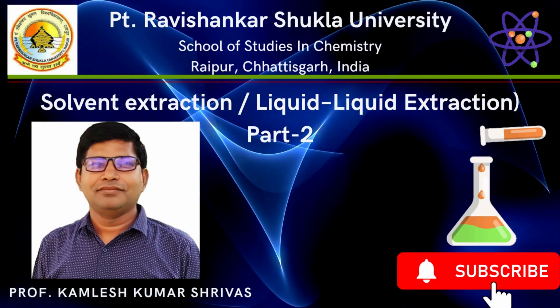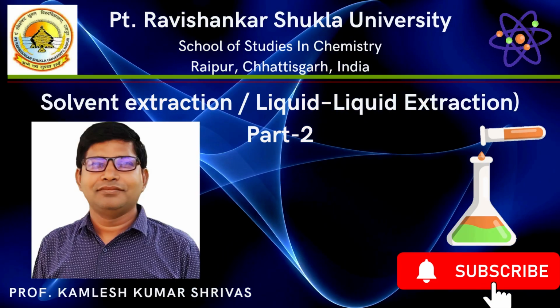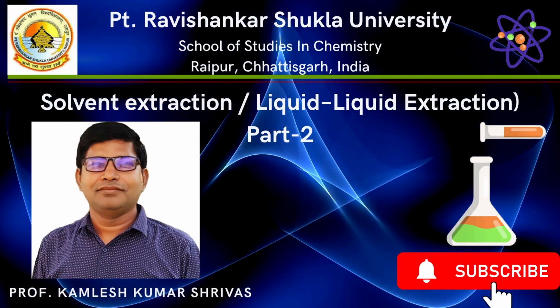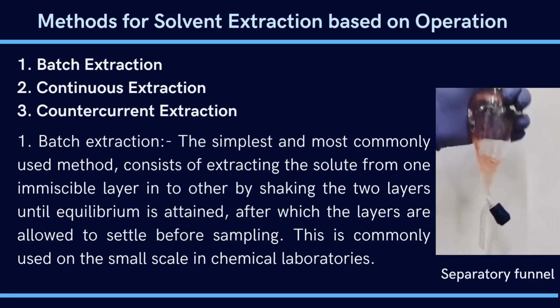In this part, we will see the methods of solvent extraction, where we will see the different ways in which the solute or chemical substances can be separated from one solvent system to another for the purpose of purification or concentration. Let us see the methods of solvent extraction.